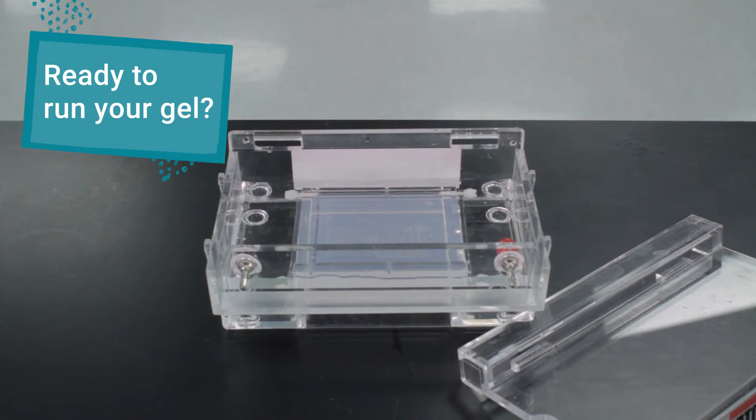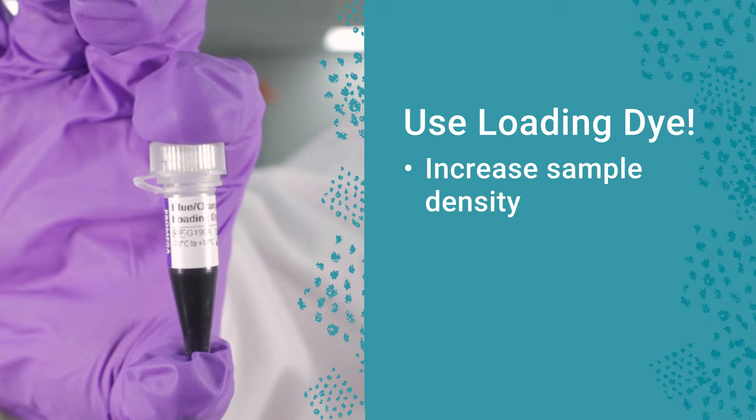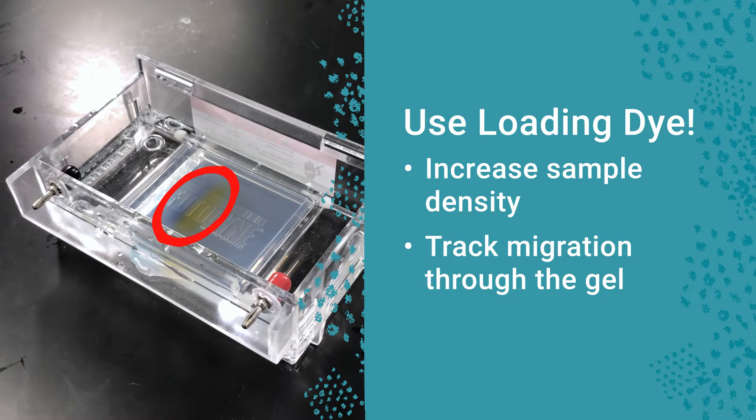When you're ready to run the gel, you first need to add loading dye to your DNA sample. This will increase the density of the sample so that it stays in its designated well and will also help you track the sample's migration through the gel.